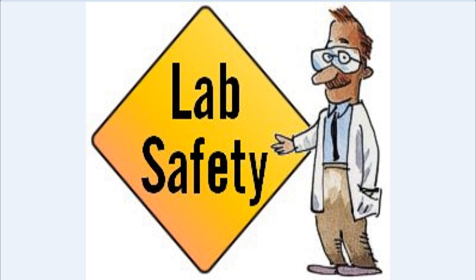Accidents and injuries. Report any accidents, spillages, breakages, or any injuries, cuts, burns, etc. to the instructor immediately, no matter how trivial it may appear. If you or your lab partner are hurt, immediately get the instructor's attention. If a chemical should splash on your eyes or your skin, immediately flush it with running water from the eye wash station or safety shower for at least 20 minutes. Notify the instructor immediately.